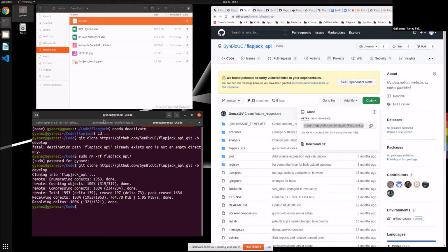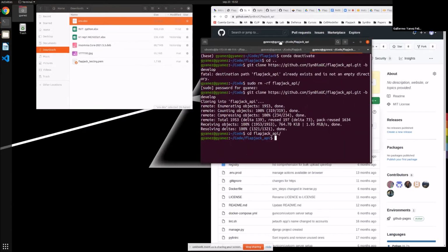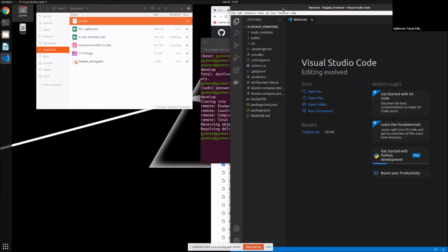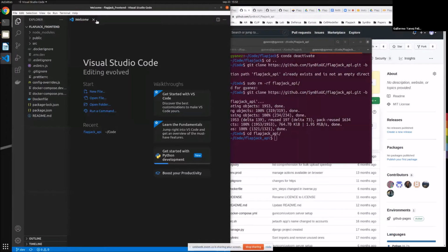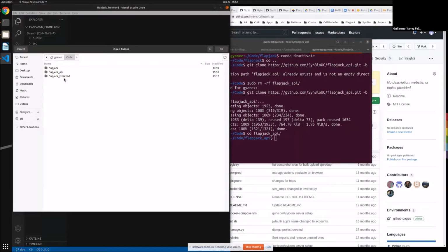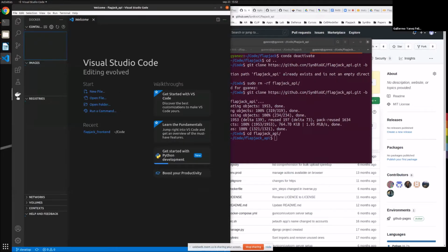All right. And then we go to the Flapjack folder, and what we will see, well, I usually do this using VS Code. I don't know what's more comfortable for you, because I use the same terminals. No containers, great.